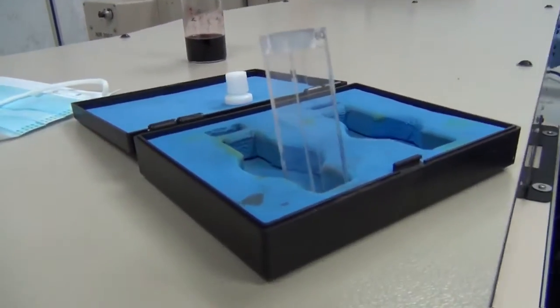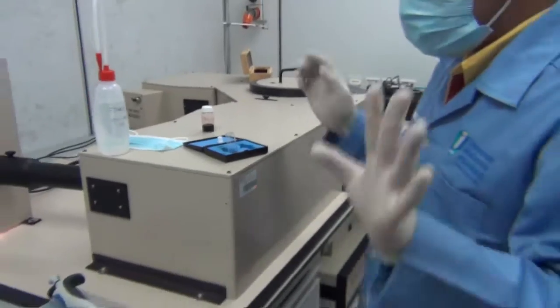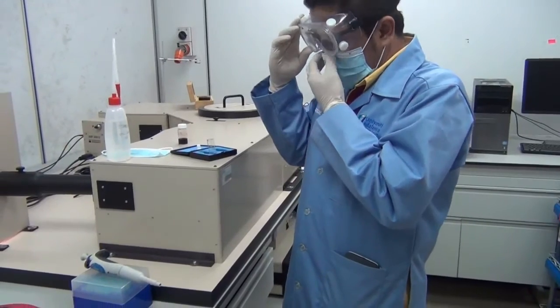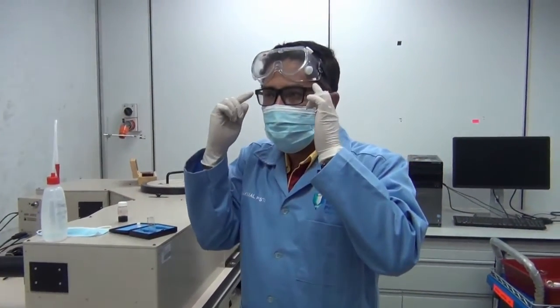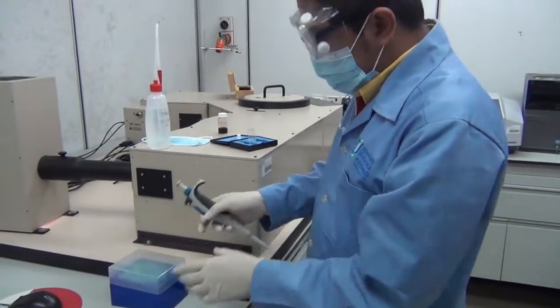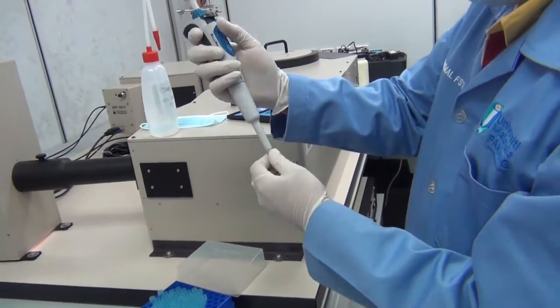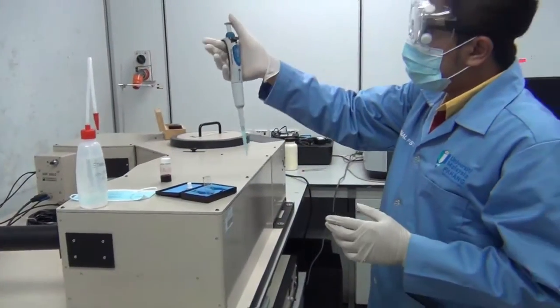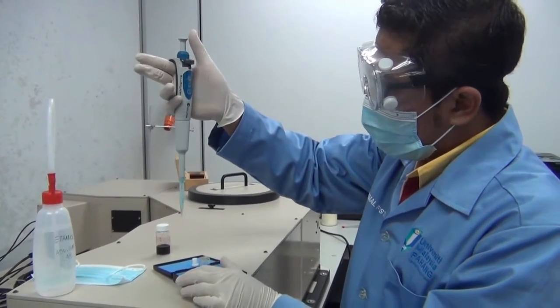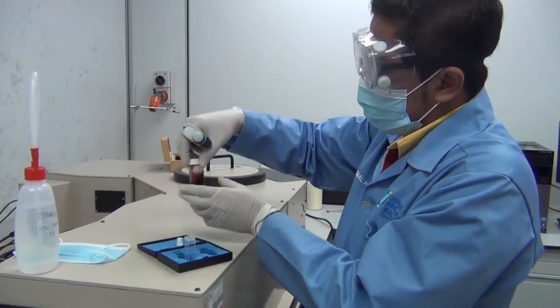Now, okay, don't forget your goggles. Put on your goggles. Make sure, even though you are wearing spectacles, you always need to use goggles. And please do not use contact lenses during our laboratory session. Just simply put the tip over here, and make sure when you are using the micropipette, it is always facing like this. It's in vertical form, not in horizontal orientation. Always in vertical orientation. So this is your sample.